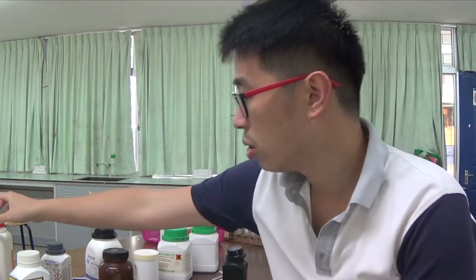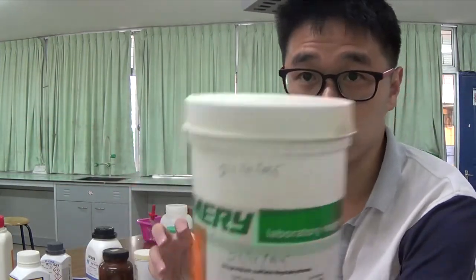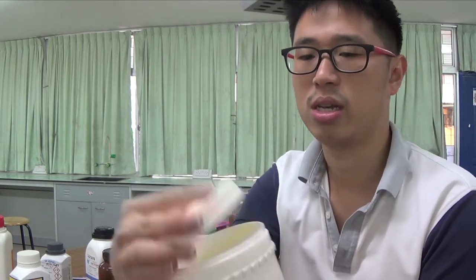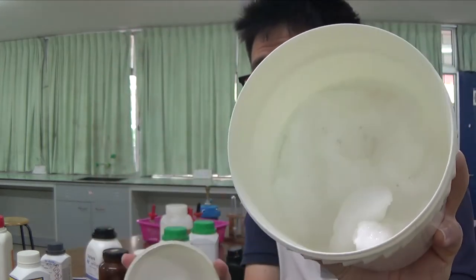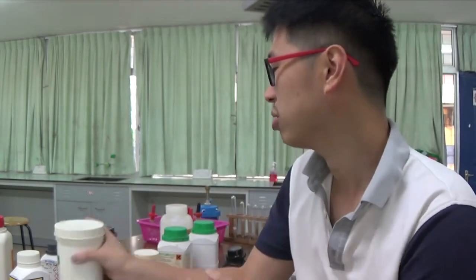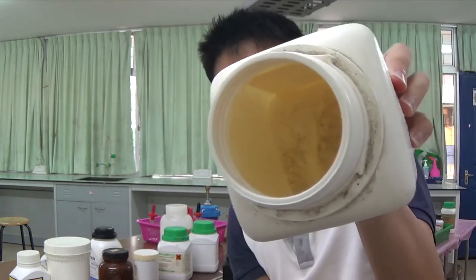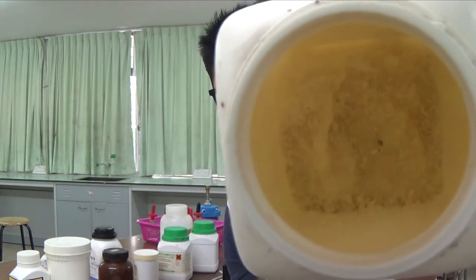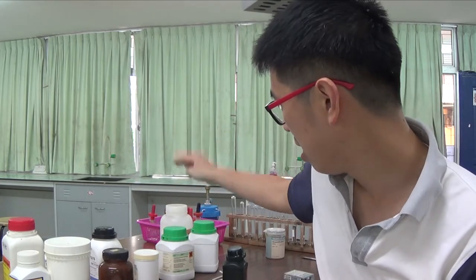And then there are also the group 1 or group 2 compounds, things like hydrated magnesium sulfate, and these are usually white. They are not colorless, they are white, just like the color of the bottle itself. These are white solids, and there was the sodium carbonate, and this is zinc sulfate. Zinc compounds are not really colored, and you will learn why once you reach A-level chemistry.